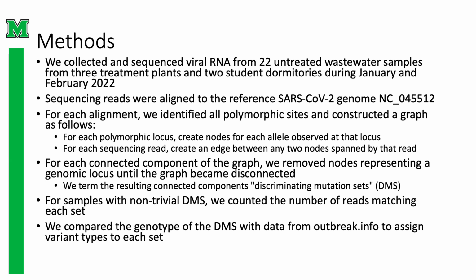We term the resulting connected components discriminating mutation sets. For samples with non-trivial discriminating mutation sets, we counted the number of reads matching each set. We compared the genotype of the discriminating mutation sets with data from outbreak.info to assign variant types to each set.